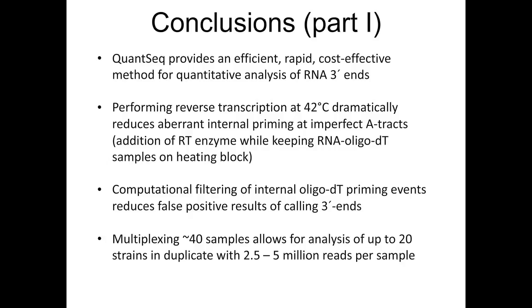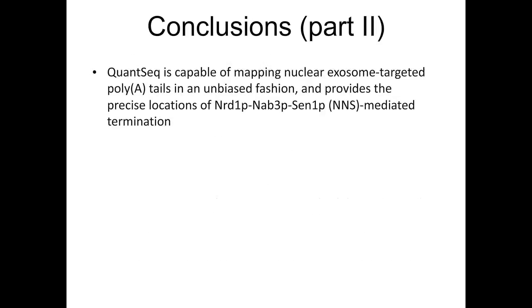And we were able to multiplex nearly 40 samples with up to 20 strains in duplicate and still obtain between 2.5 to 5 million reads per sample. So this allowed us to really do a lot of biology and to uncover how the RNA polymerase termination was occurring. And so we also were able to conclude that the QuantSeq method is capable of mapping nuclear exosome poly-A tails in an unbiased fashion, so that the poly-A tails are indeed long enough, and that these reveal the precise locations of the NNS termination pathway.